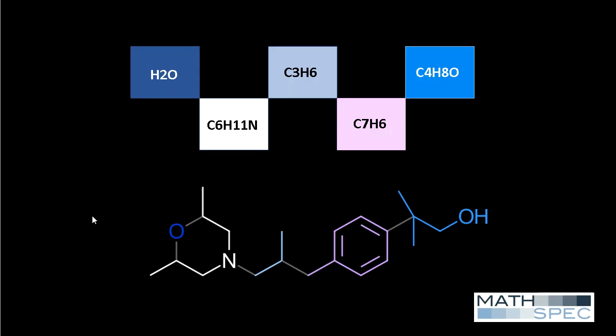So we can hypothesize that the C4H8 in our analyte has become a C4H8 with an oxygen on it. Now the number of hydrogens in the subfragments often differs from the number of hydrogens in the corresponding substructure. Other partitions may select a different set of bonds to disconnect.